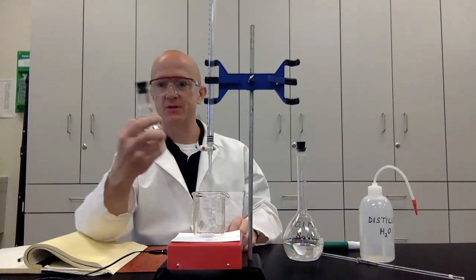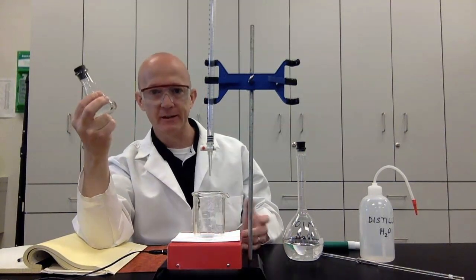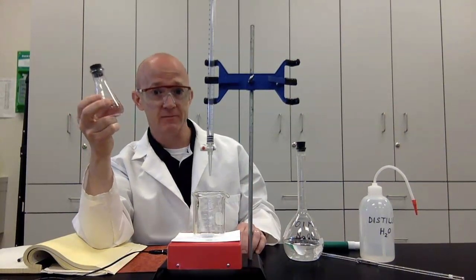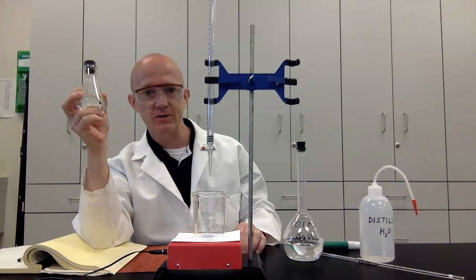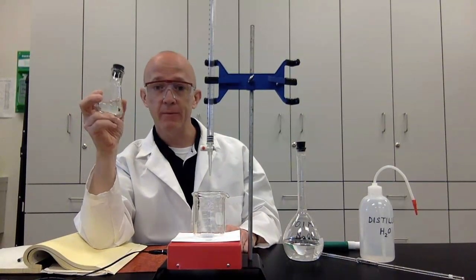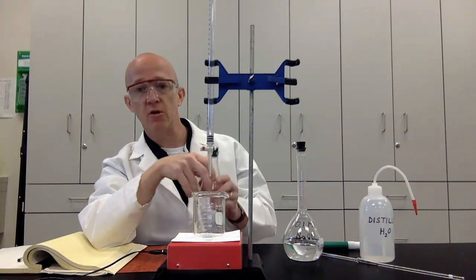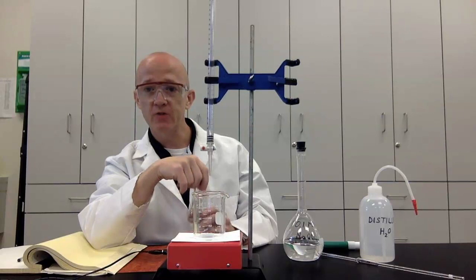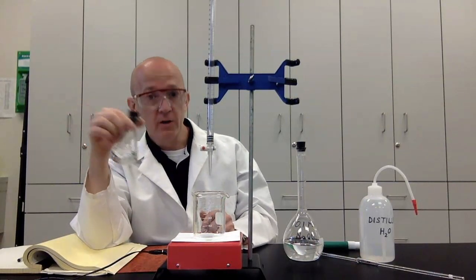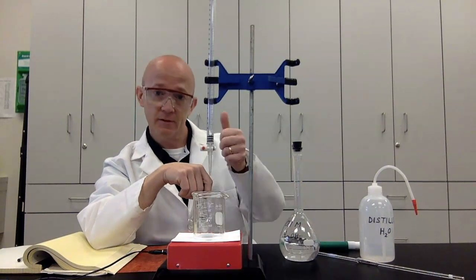So he put this weak acid inside this flask, but didn't label it. I know it's a weak acid, I know it's acetic acid, but he didn't label what the concentration was. Come on, Slim. Anyway, there is a way I can figure this out, and we're going to do this together today. This is called a titration, and it'll show you how we can determine the concentration of an unknown based on using the concentration of a known. Let's go.